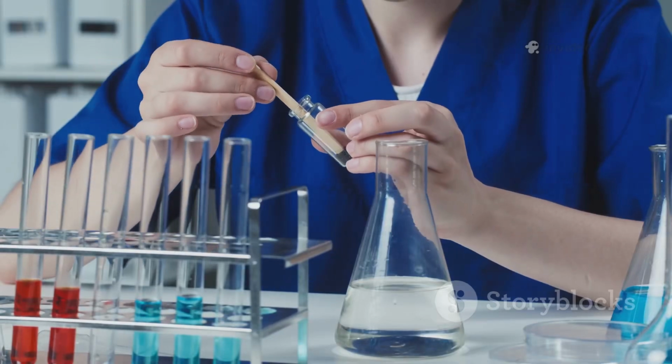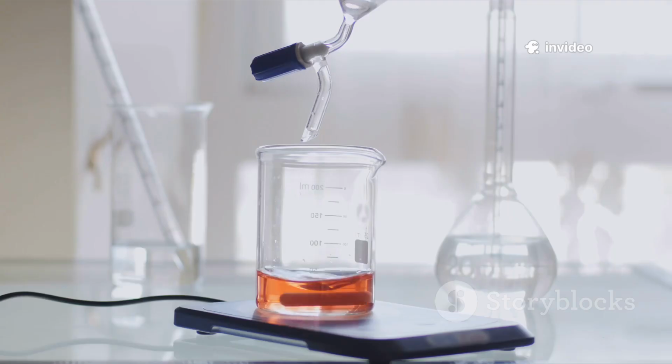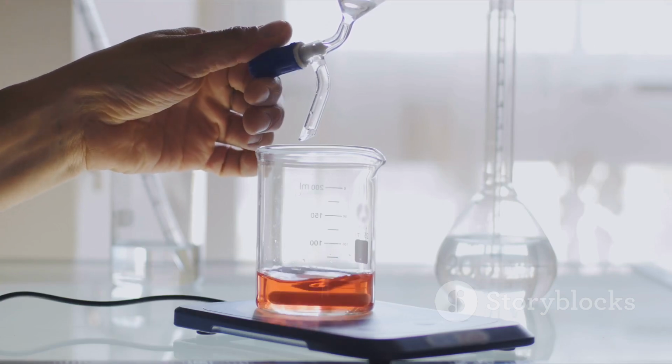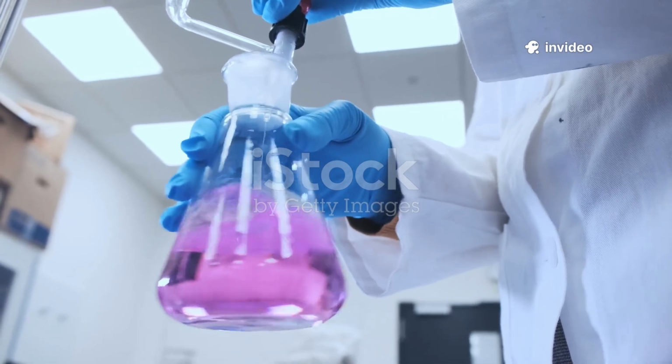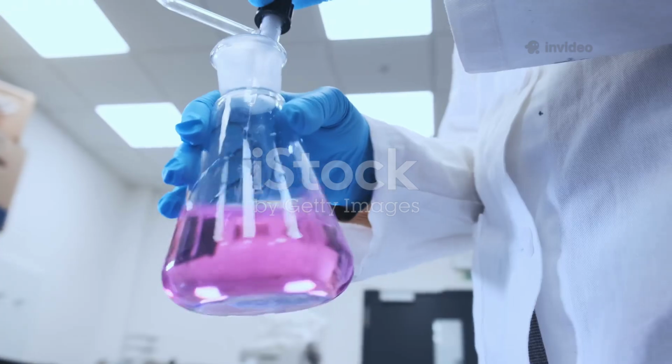Alright, let's break down conductometric titration, the chemistry hack you never knew you needed. Imagine you're titrating an acid with a base, but instead of waiting for a color change, you're tracking electrical conductivity. Sounds fancy, right? But it's actually super simple. Here's the scoop. In a conductometric titration, I measure how well the solution conducts electricity as I add titrant.